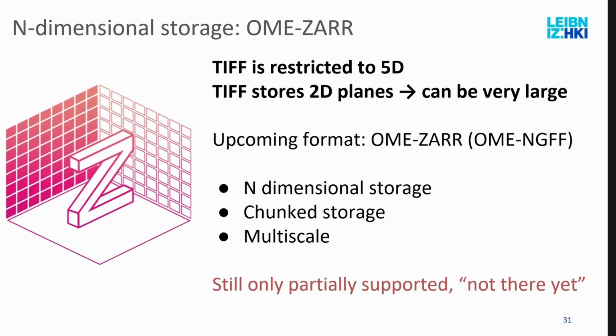Also, it can not only store 2D planes, it can store the images in a different, more optimal format. You will at some point encounter this OME-Zarr format or OME-NGFF format. You can read up about how fancy and great it is, but you will encounter it because the people behind it are working together with the microscopy providers and with the image analysis tools, the commercial ones, to actually support that.